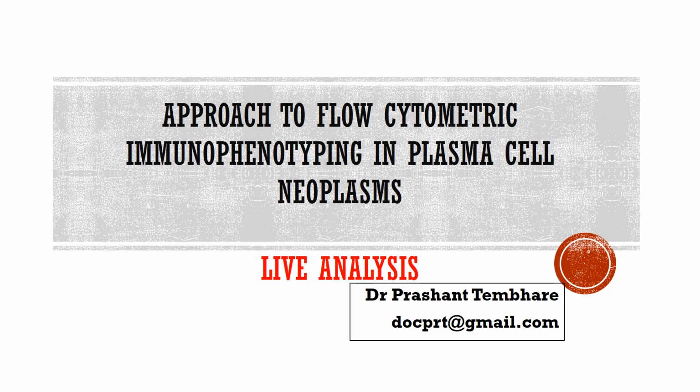Hello everyone. So after discussing different approaches and the value of immunophenotyping in plasma cell neoplasm as well as minimal residual disease, we have also gone through the live analysis, live processing, and acquisition of plasma cell samples and MRD samples today.